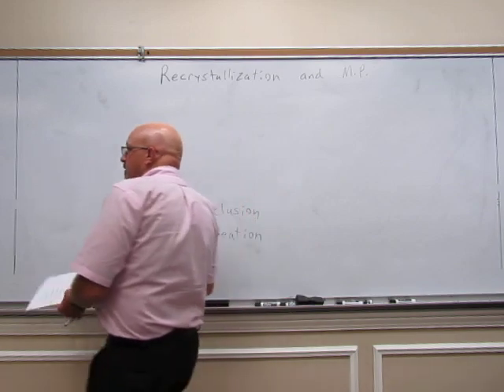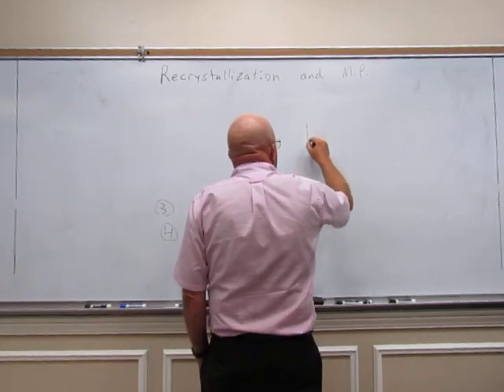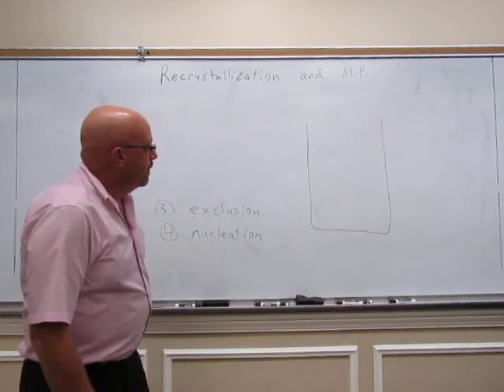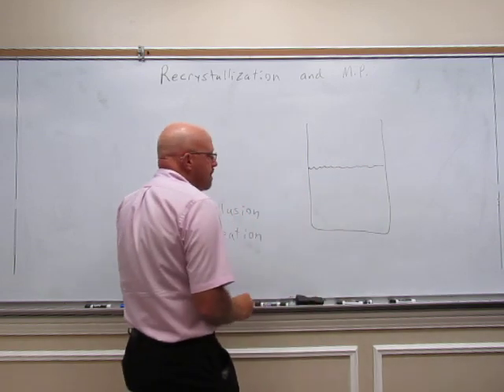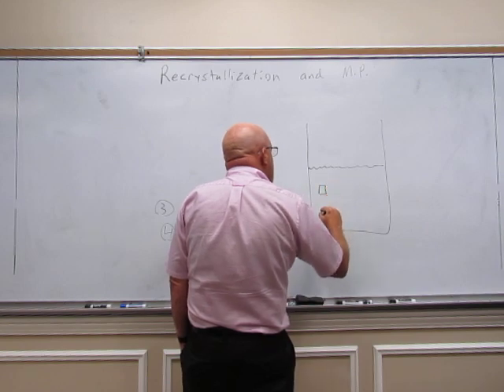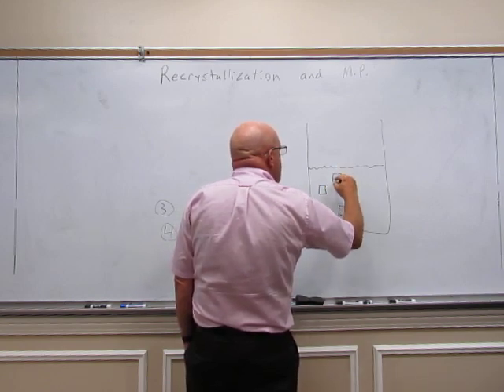Let's talk about exclusion. Say we have a beaker here, and we have our solvent. And we have the solute dissolved in the solvent.